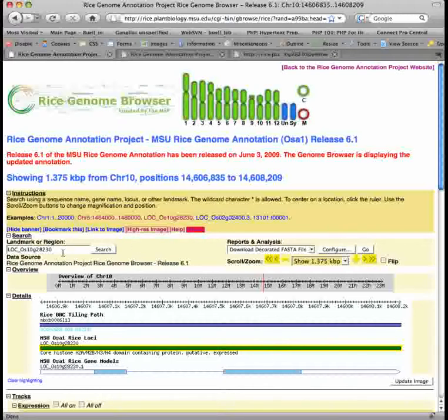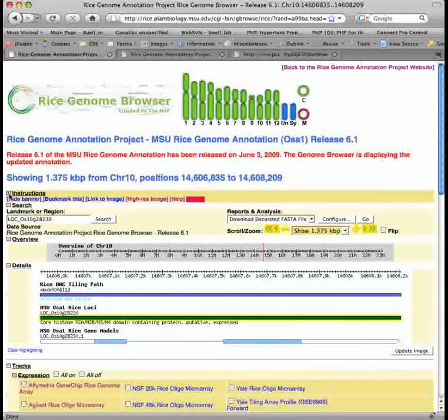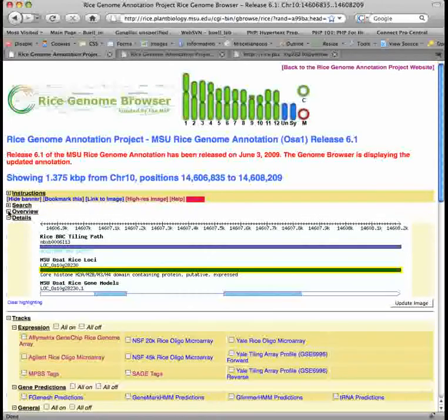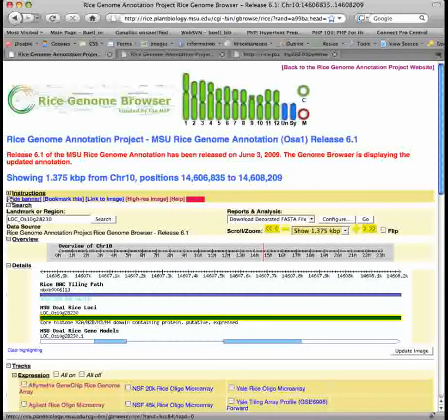If there is extra information on the page you do not wish to view, you can collapse it by clicking the minus button. To get the information back again, just click the plus button.